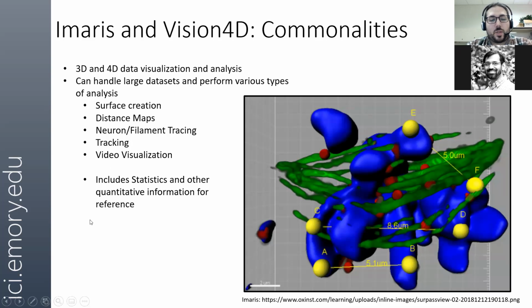The secondary thing I want to stress is, in addition to creating these structures and performing these analyses, which are very nice for visualization, both of these softwares are also able to provide quantities.